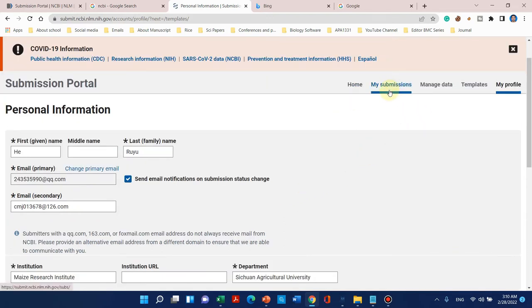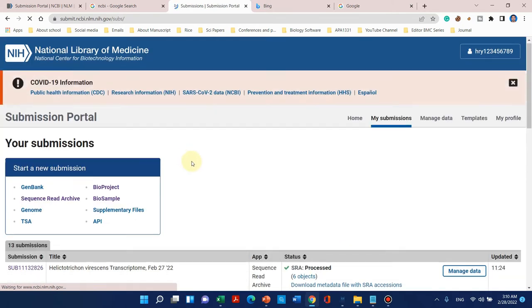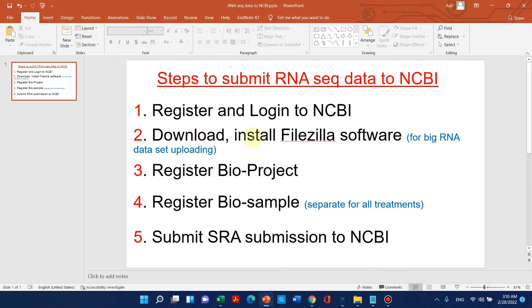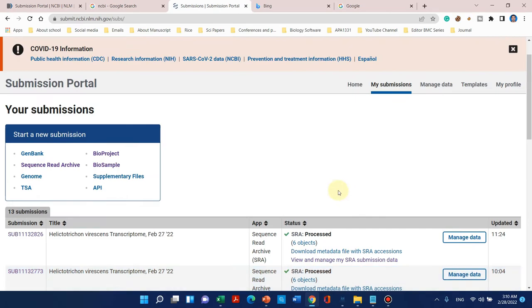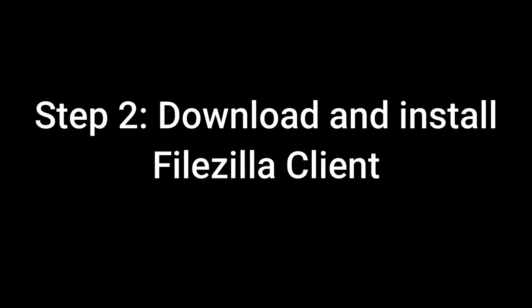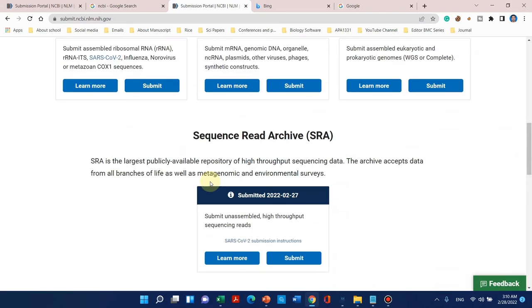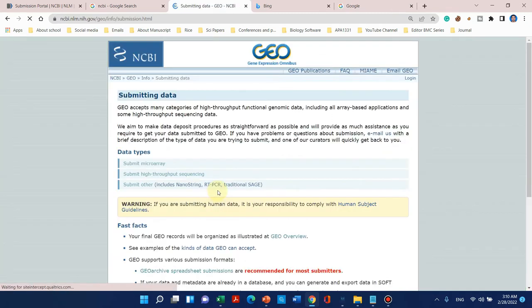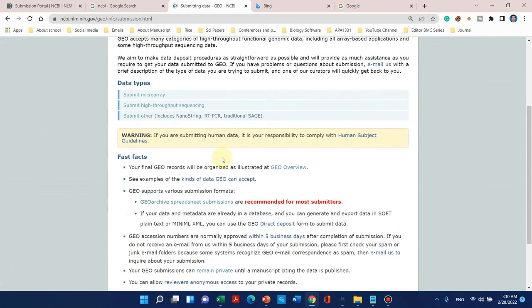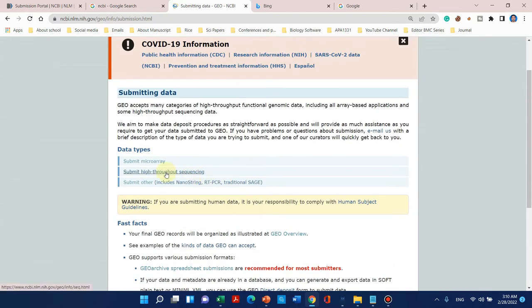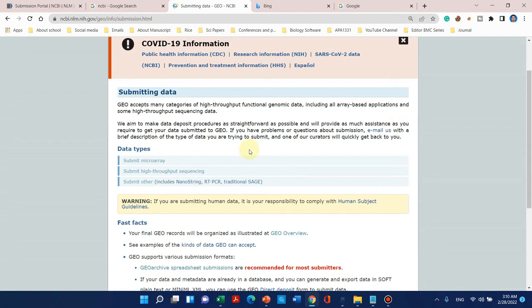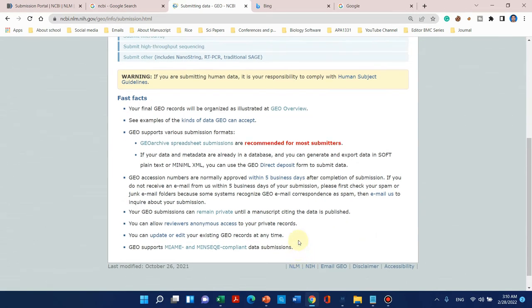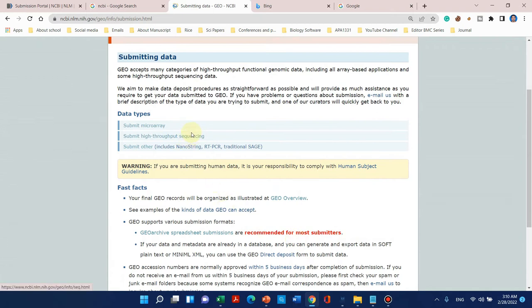Now let's move to our second step: downloading and installing the FileZilla software. We can simply download it from its website. I recommend you to read all the information on the page and don't rush while submitting the data. It is easy but usually time-consuming.